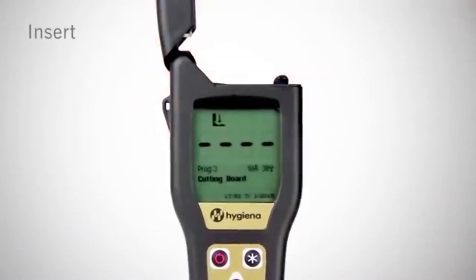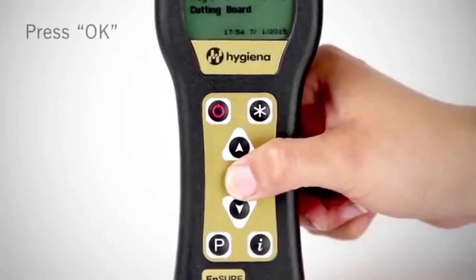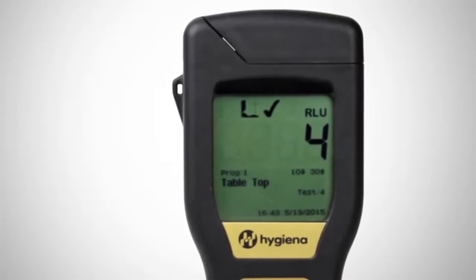Insert the swab into the reed chamber and close the lid. Hold the luminometer upright and press OK to initiate measurement. Results will be displayed in 15 seconds.